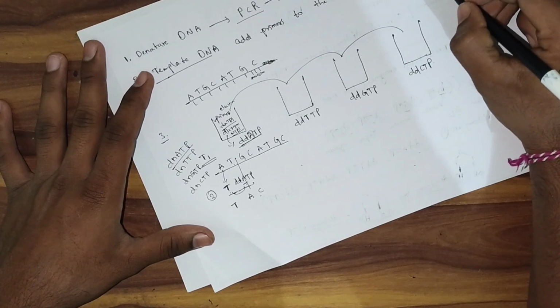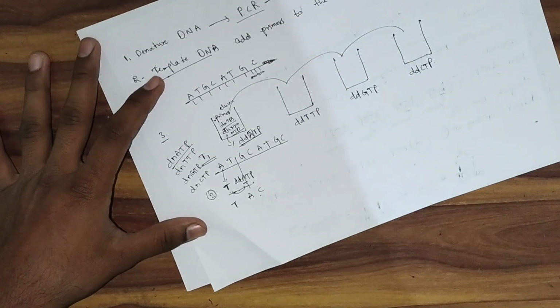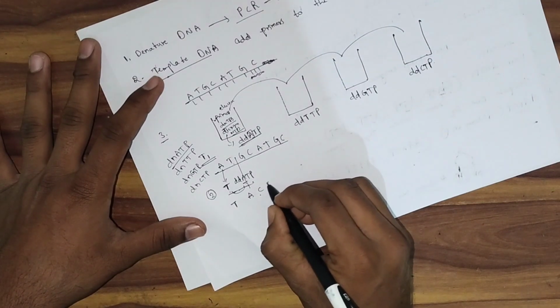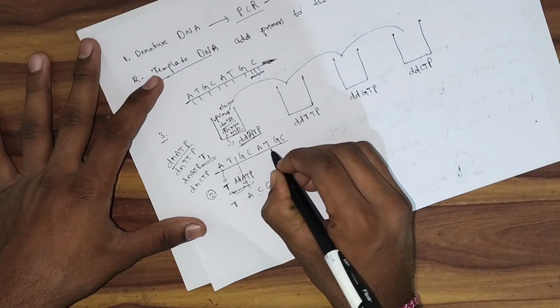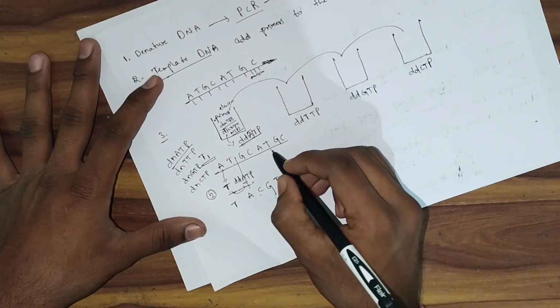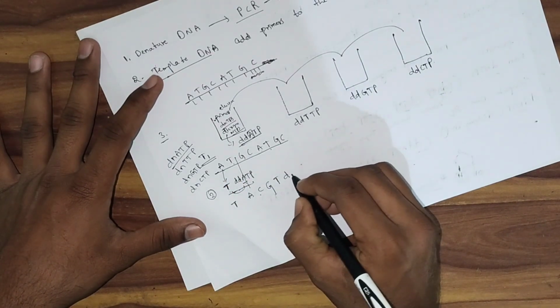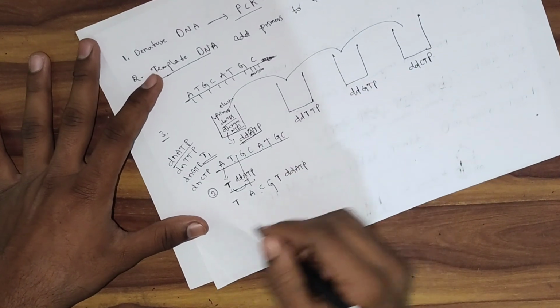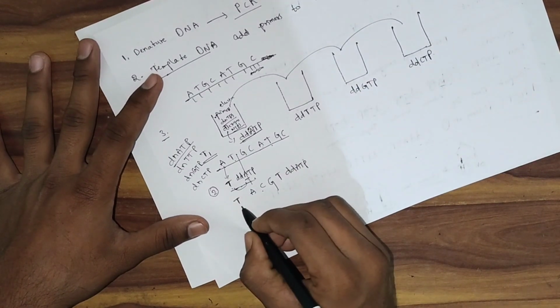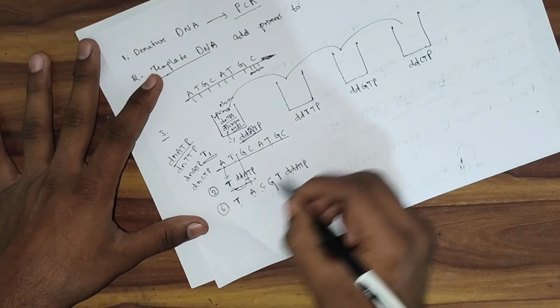Here a triple bond occurs between guanine and cytosine. Here we have to take cytosine means guanine, adenine means thymine, thymine means adenine. If a dideoxynucleotide, dideoxy ATP, is incorporated, it stops. So what is the number? 1 2 3 4 5 6. The 6 will occur.